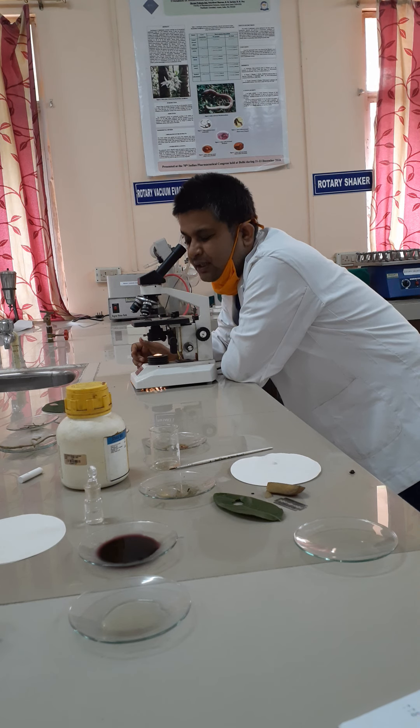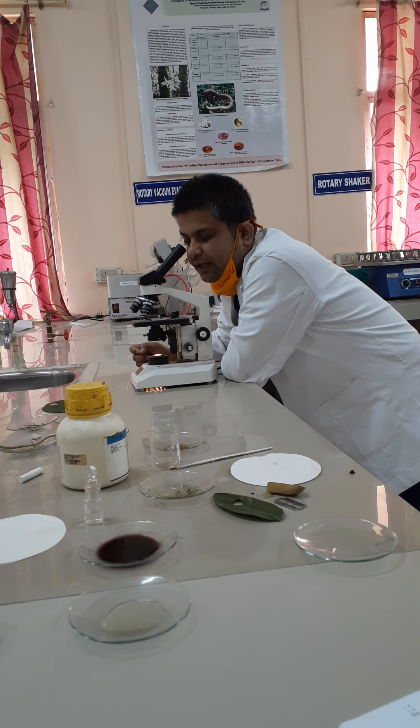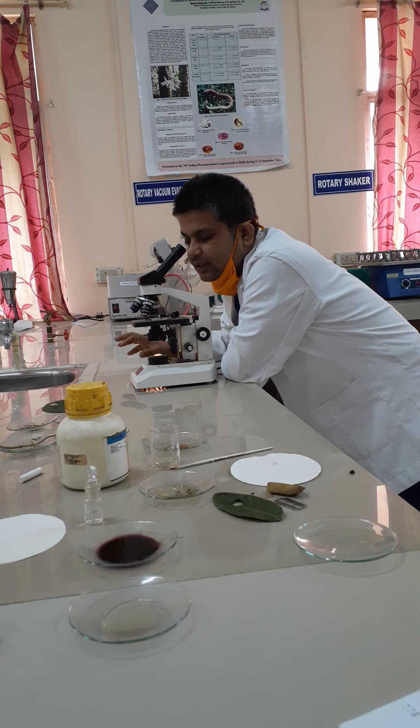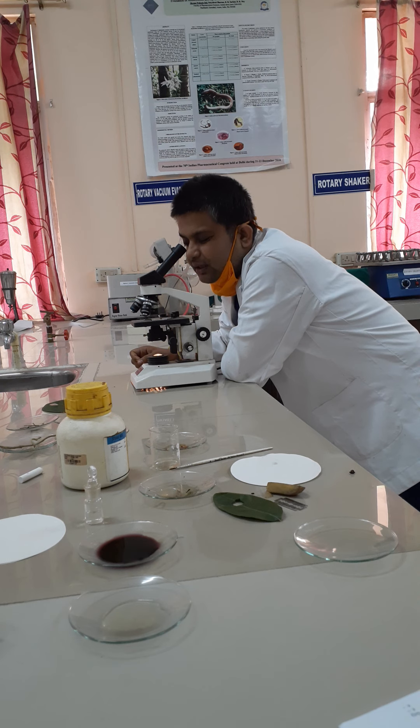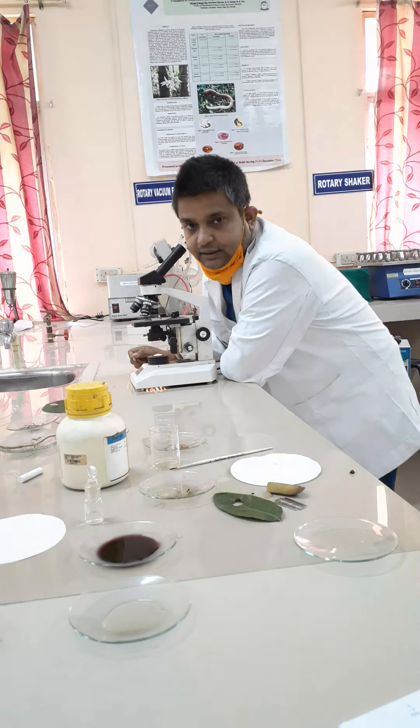In the midrib section, you will find thick collenchyma cells. In the middle part of the midrib, you will find the vascular bundle, which consists of an alternate arrangement of xylem and phloem parenchyma. It is surrounded by transparent parenchyma cells. In the midrib, you may also sometimes find some glandular trichomes.